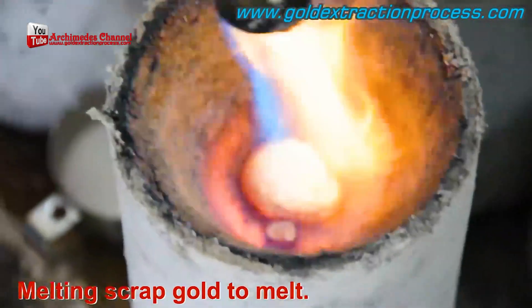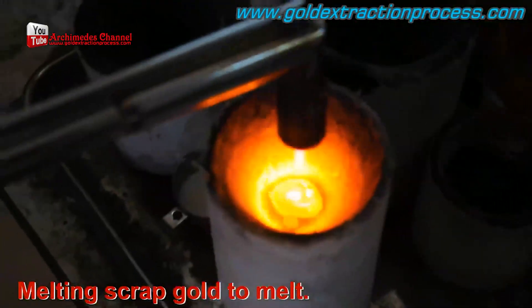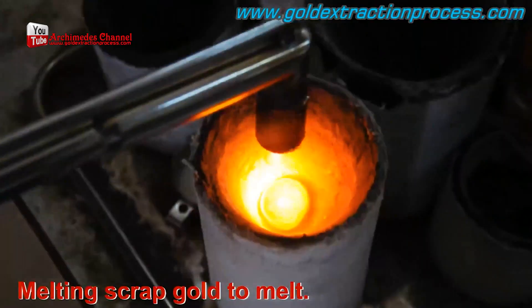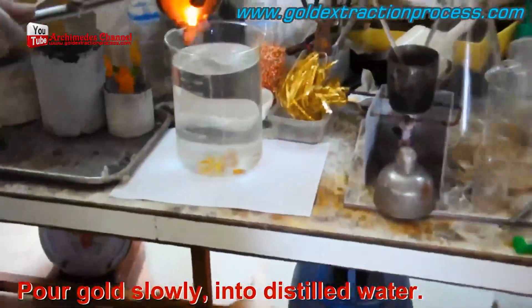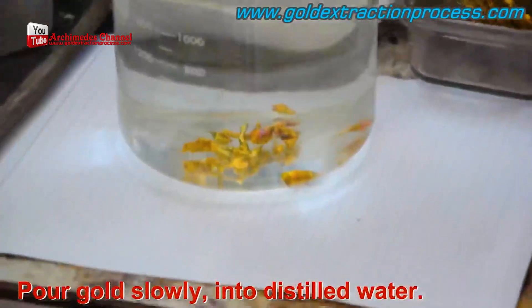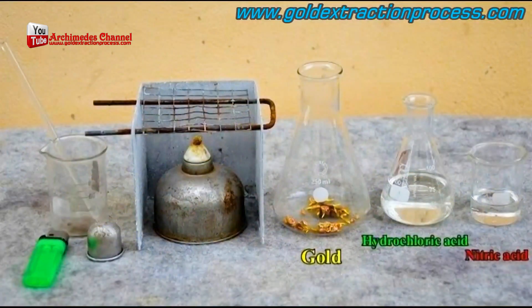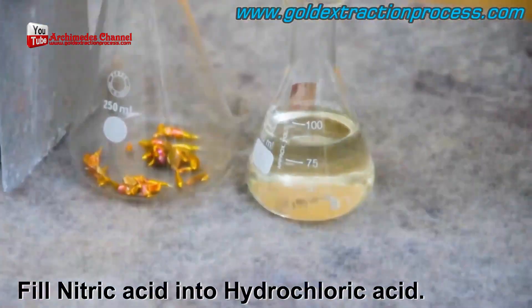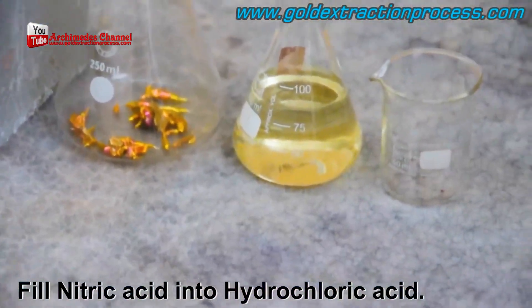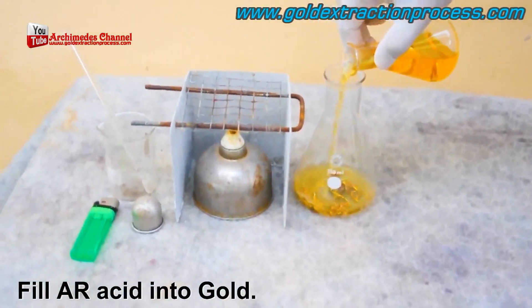Over at the Archimedes channel, they're always working on ways to help you figure out how to extract and refine gold, whether it's in a lab, a shop, or at home. Remember, always safety first. Starting with some gold scrap placed in a crucible and poured into distilled water, hydrochloric and nitric acids are mixed and then poured over the gold.